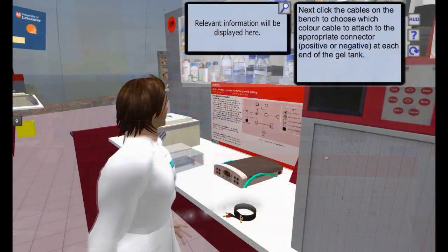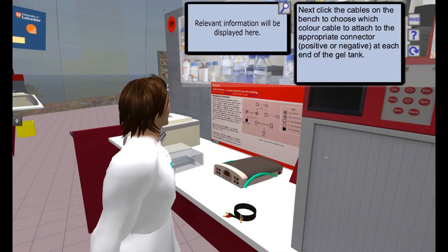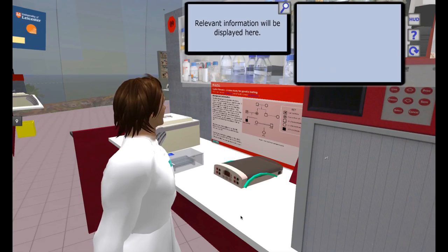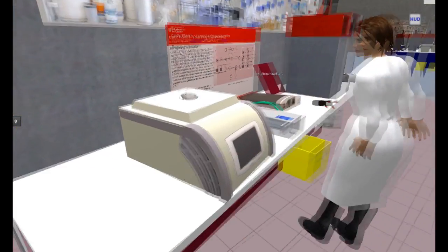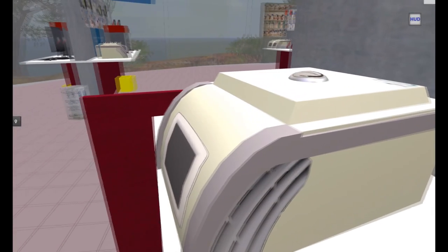As they move through the procedure, they experience the sequence of events for genetic testing. The PCR machine, that multiplies the patient's DNA.